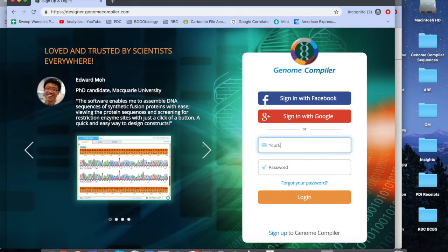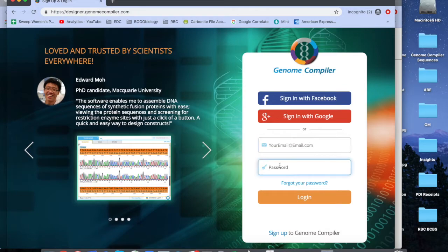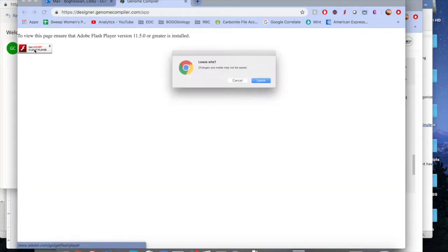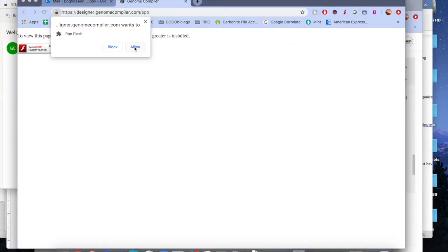Log on to Genome Compiler. Before you can use the free version of their software, you'll need to either log into an existing account or create an account. You may also need to enable Flash Player if you're using a Mac.